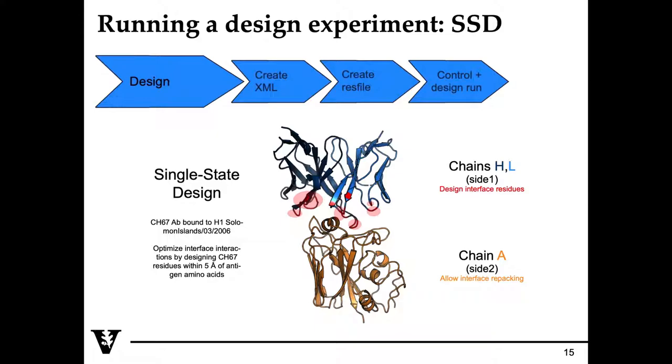For today, the first tutorial we're going through is single-state design. During this particular design experiment, what we have is a fragment antibody in both the heavy and light chain, shown in dark and light blue. What we're interested in designing is the residues within the fab that are within five angstroms of the binding interface of our antigen. I've highlighted here in red these residues that are defined as the interface residues.